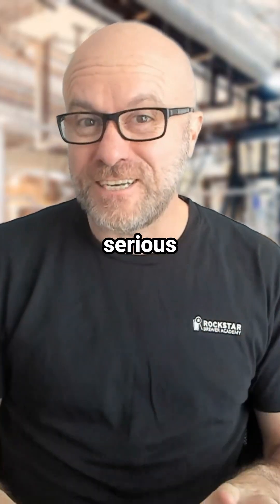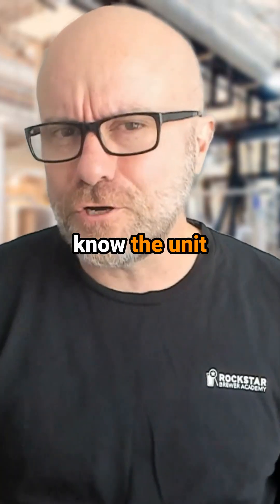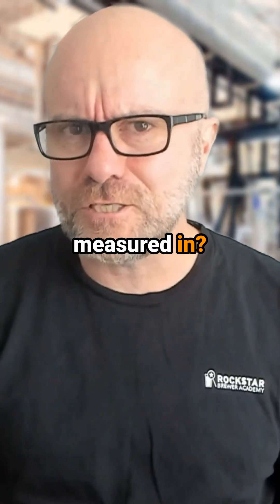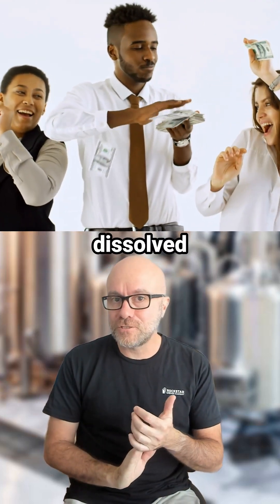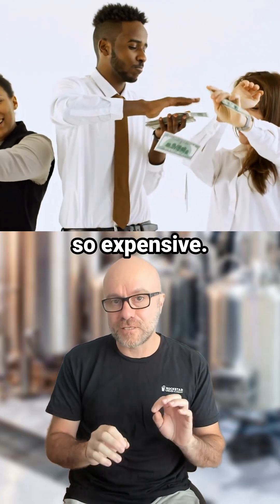We all know that dissolved oxygen does serious damage to beer quality. But do you know the unit of measure that dissolved oxygen is measured in? Drop us a follow, because I'm going to show you why measuring dissolved oxygen with a DO meter is so expensive.